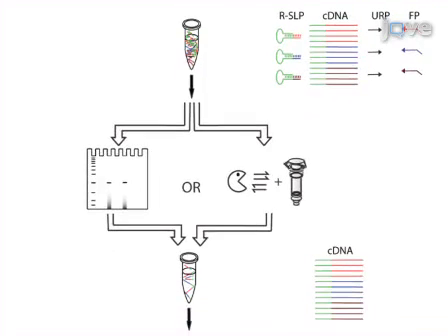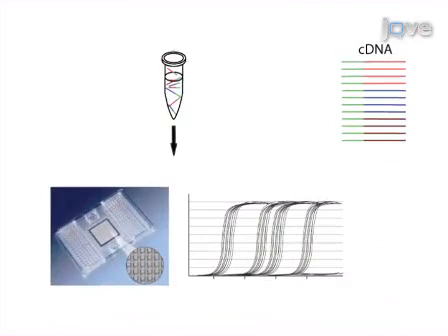This begins with concentrating extracted RNA, followed by multiplex reverse transcription and multiplex preamplification. The next step is to purify away excessive primers. Finally, singleplex microRNA expression is profiled using a microfluidic platform. The result is accurate and highly reproducible microRNA expression levels across samples of interest.